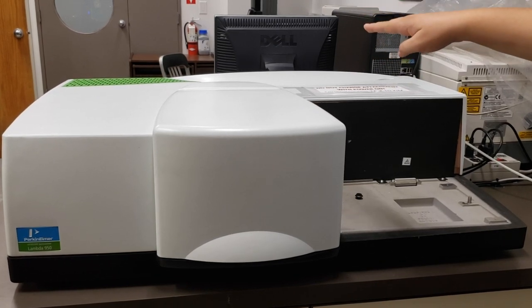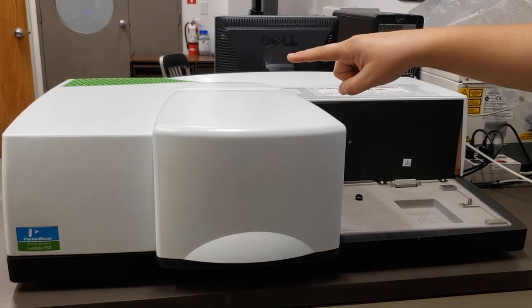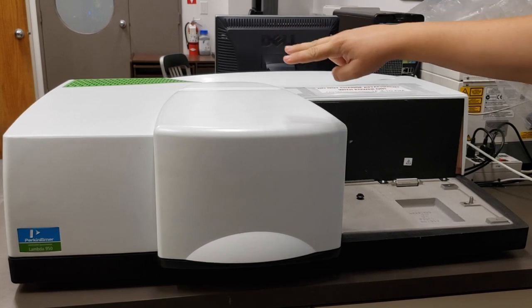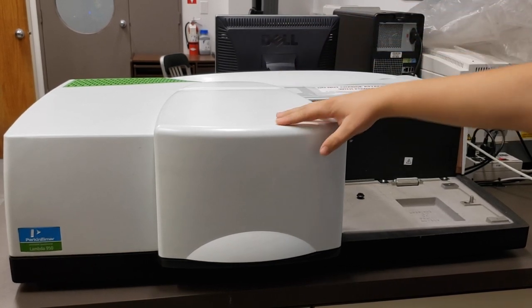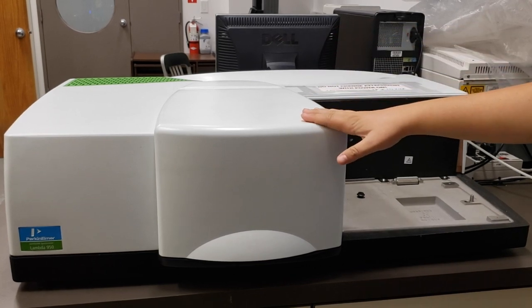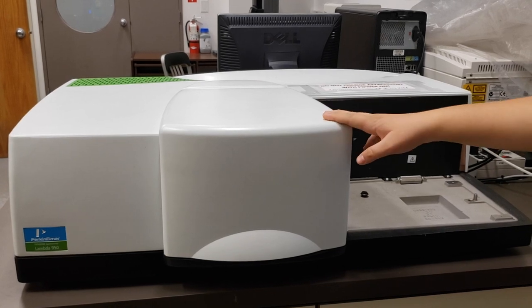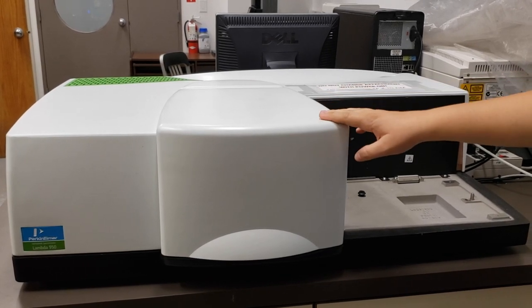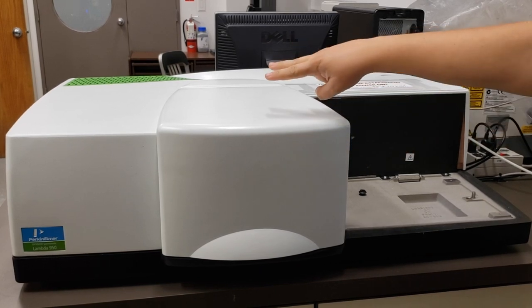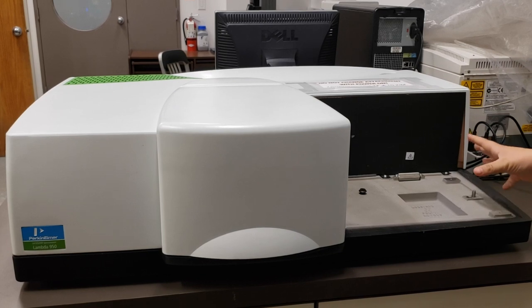The monochromator filters one wavelength of light through to the left side. There is a beam splitter, so we end up with two beams, and those two beams pass through the middle portion and into the detector. The 2D detector is the simplest of our detectors and also has the widest range available to it. It is mostly used for liquids.